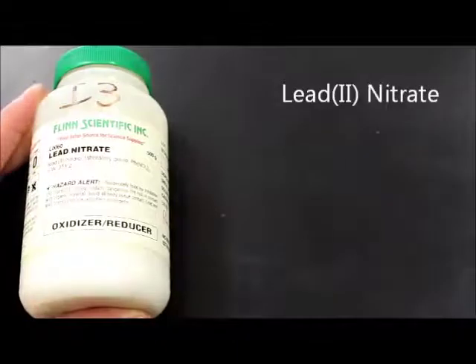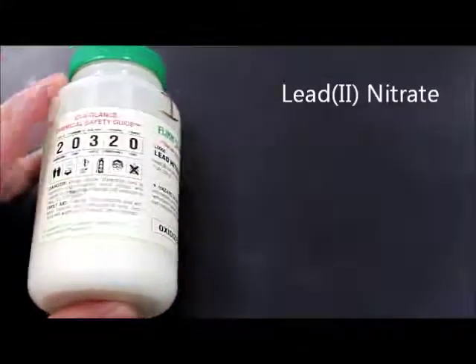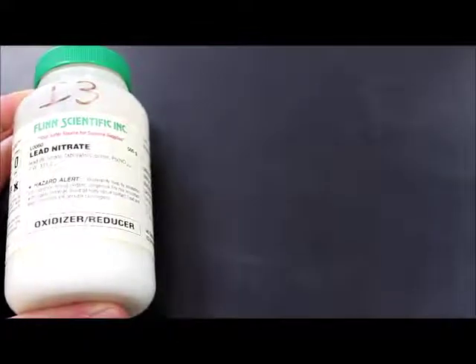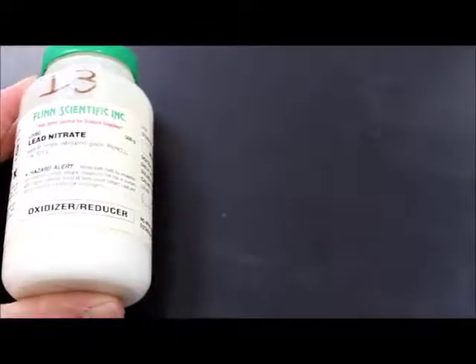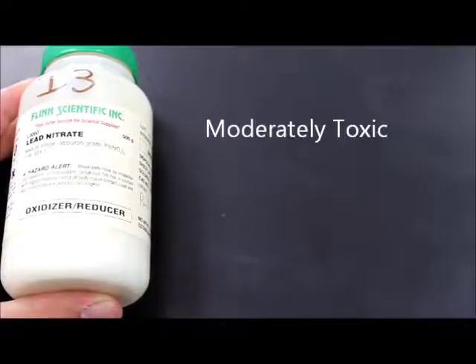Alright, so here we're going to take a look at some of the chemicals that we're going to use in the lead 2 iodide lab. The first one being lead 2 nitrate. And if we look at the safety information about lead 2 nitrate here, what you're going to see is that anything that contains lead in it, including the lead nitrate here, is going to be moderately toxic to you.